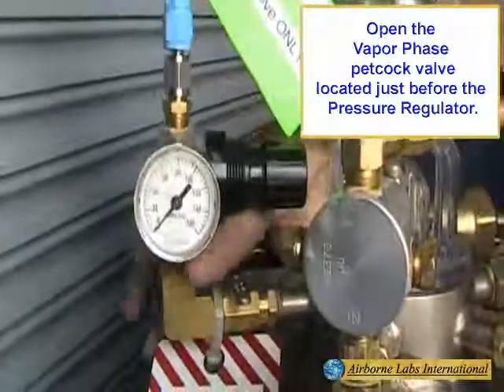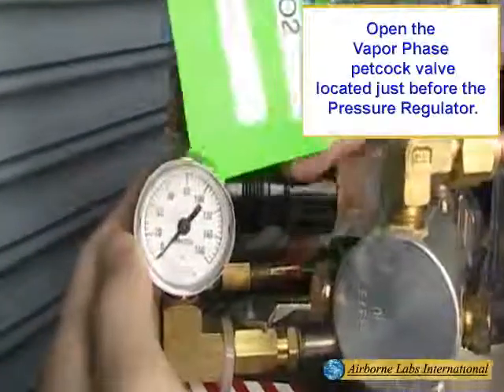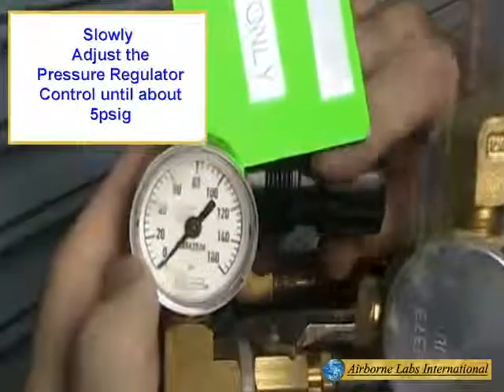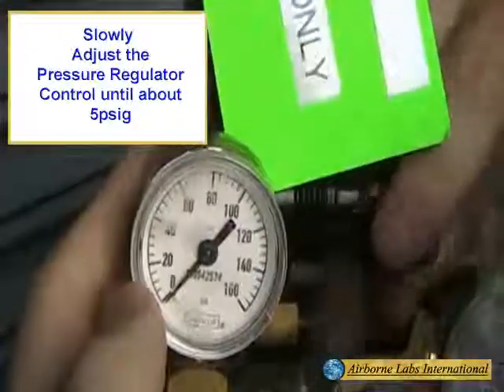Open the Vapor Phase petcock valve located just before the pressure regulator. Next, slowly adjust the pressure regulator control until about 5 PSIG is registered.